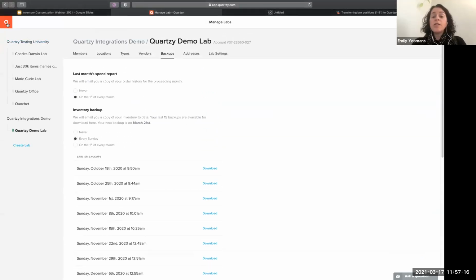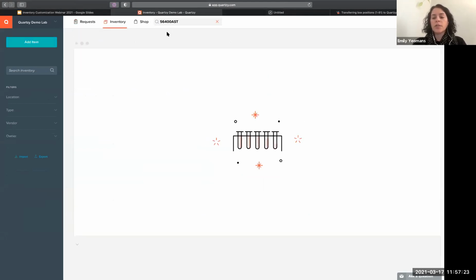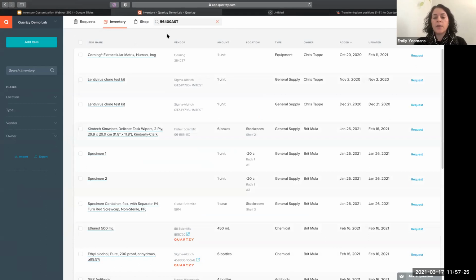Great. Yeah. And then once you get that CSV file, a couple of people are talking in the chat about how you can sort it any way you want. You can filter, you can sort it alphabetically, whatever works best for you. You can definitely do that. And someday we do plan on having a more customized template so that you can add in formulas and calculations into your inventory, add grant ID, balances and stuff like that. So definitely stay tuned for those updates.